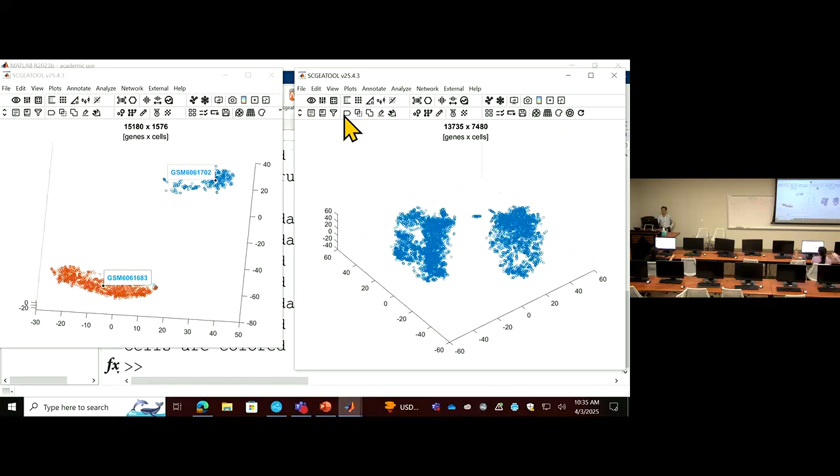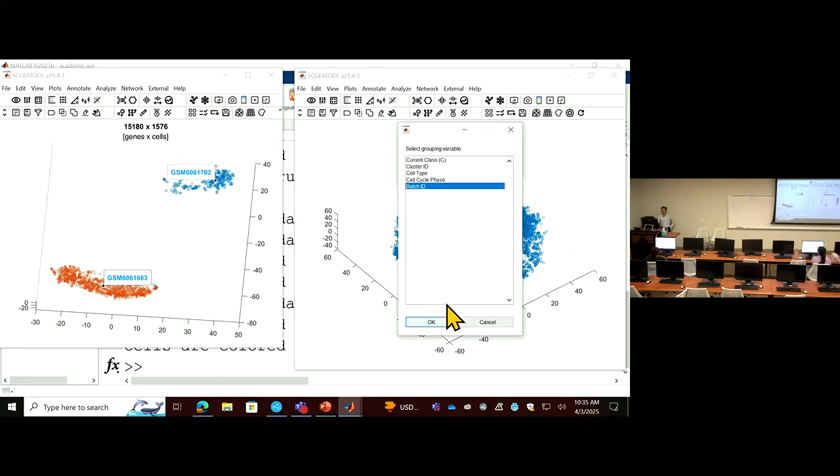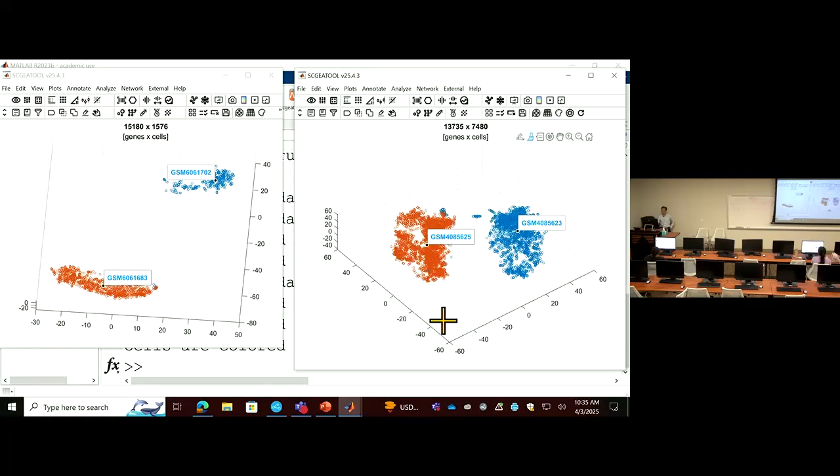This fibroblast is between 2 samples, okay? So we need to have this clear setup, and we know what cell type we're focusing on and what 2 groups are, okay? The numbers of cells are comparable, so we can estimate the variability relatively accurately.